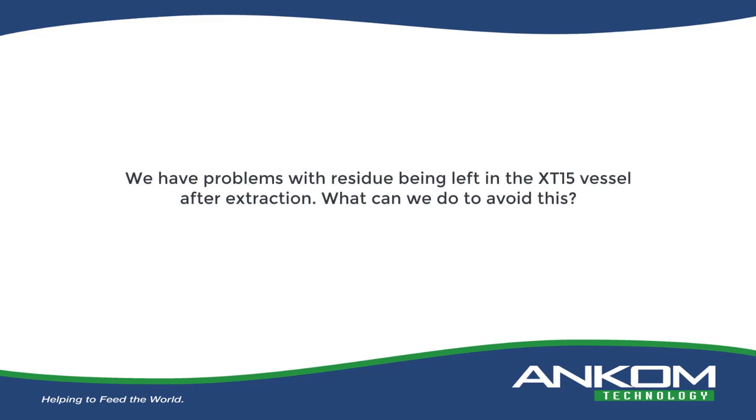We have problems with residues being left in the XT15 vessel after extraction. That's interesting. I'm not sure. Any other idea as far as what the residue is?